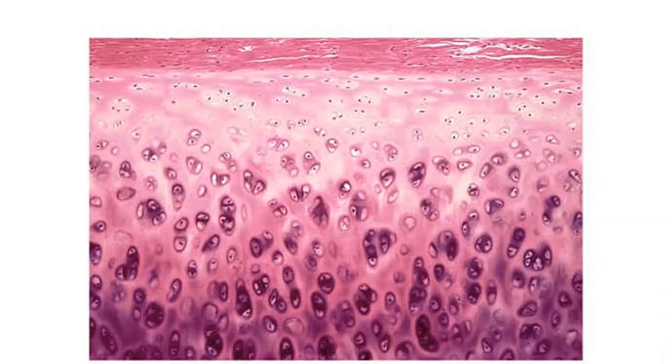Okay, ignore the very top. So look from here down, all the way down. What do you see? What jumps out to you? Eyes in the jungle, maybe? If it's eyes in the jungle, we know to head straight for cartilage. And then once we know it's cartilage, we need to distinguish between the three types by looking at the matrix. And this matrix is clean and glassy. So clean, glassy matrix is hyaline cartilage. Function, support. Location, embryonic skeleton, costal cartilages, laryngeal cartilages, and some joint cartilages.